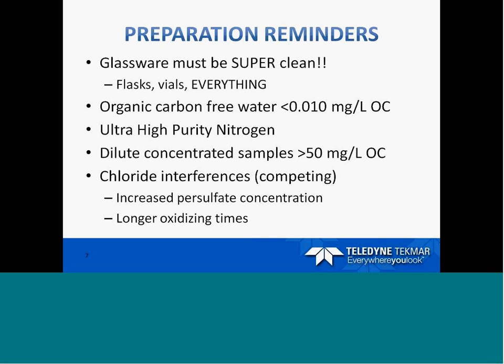These chloride interferences, so if you have salt or anything else in your sample, are actually going to be competing with the persulfate for the oxidation, so you end up having not a completely oxidized sample. So in the beginning, when we said that you must remove all of the inorganic carbon, if you have salt in your samples, there's a couple things that you can do.